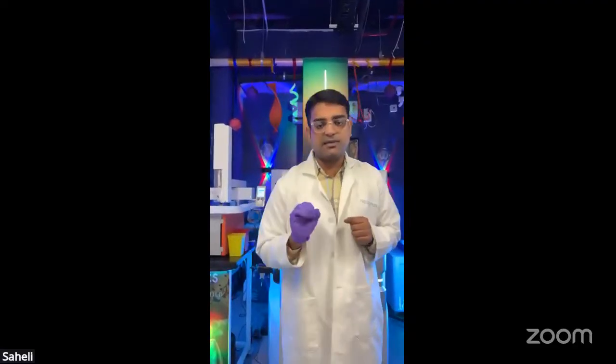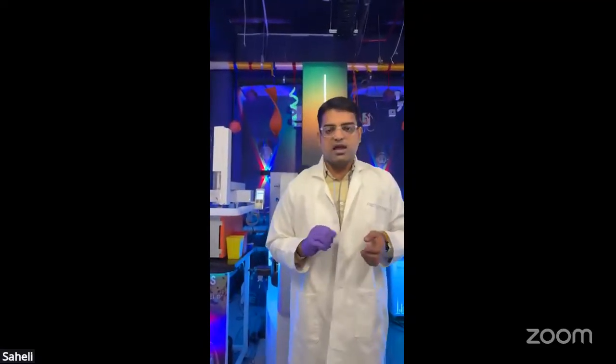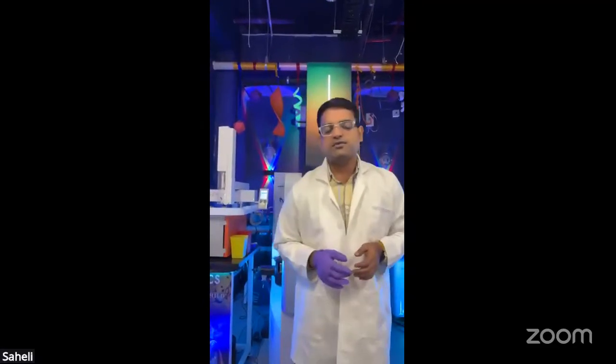The most important thing is that you can store the samples and analyze them after 3 to 6 months. As we have the property of ion mobility and the cross-sectional area, if the sample is degrading or something happens, the areas will be the same. So reproducibility is very high in this kind of case. This is one of the instruments. So now Professor will give you the brief.